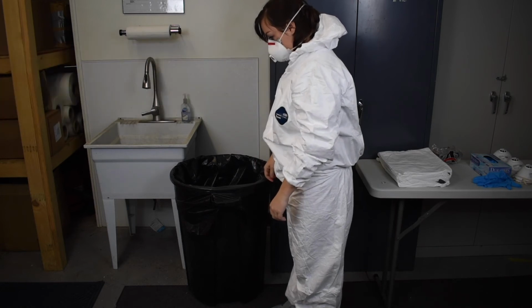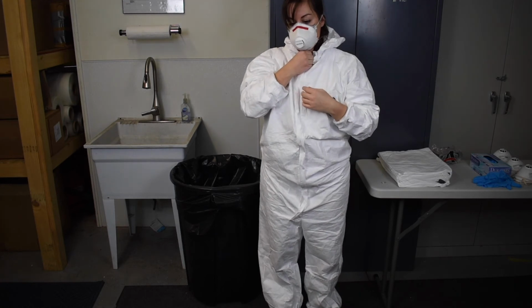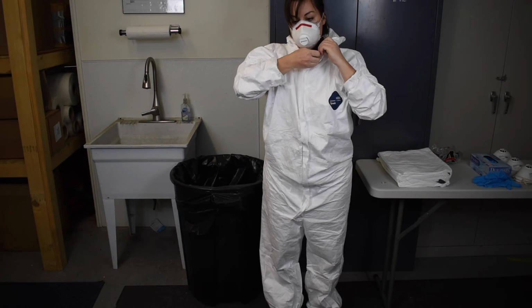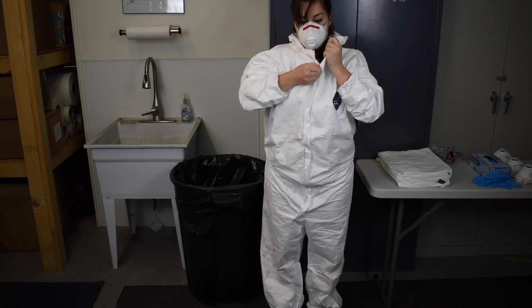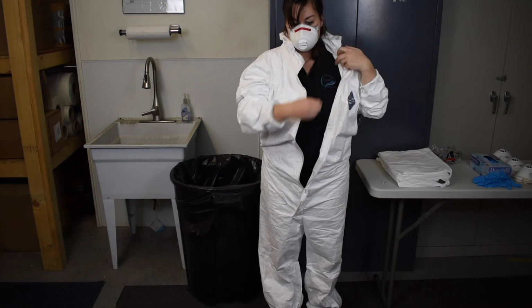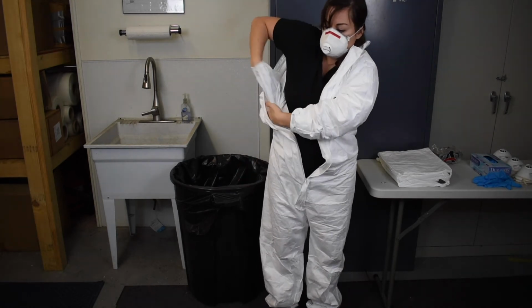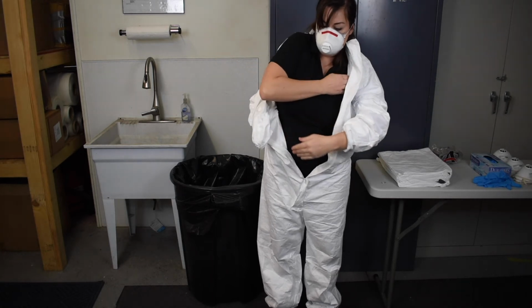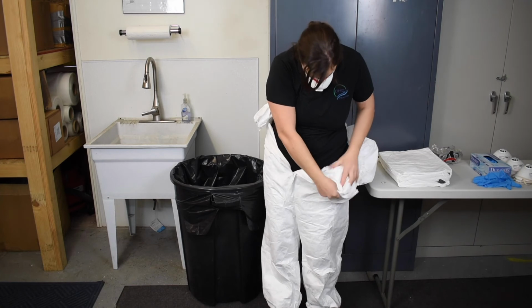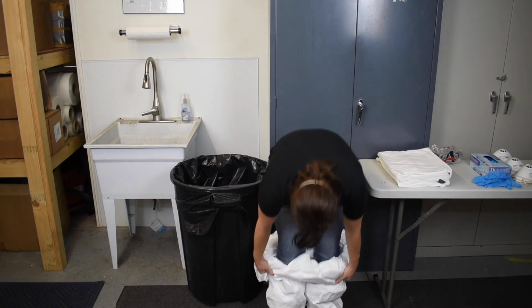Next, remove your coverall. To remove your coverall, place one hand on your navel and follow the zipper up and unzip. Grab the coverall from the outside and pull it away from your body and down, turning it inside out as you pull. Avoid contact with your scrubs or clothing with the outside of the coverall, touching only the inside of the coverall. Remember, the outside of your coverall is contaminated, so move slowly.